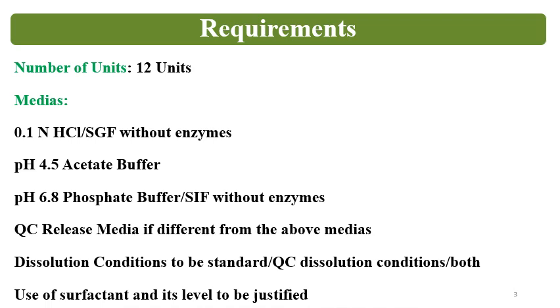If your QC release media is not among these three media, then the fourth media will be the QC release media. Dissolution conditions should be standard.